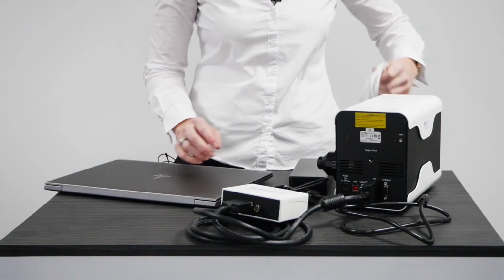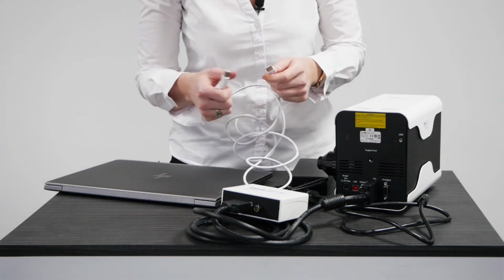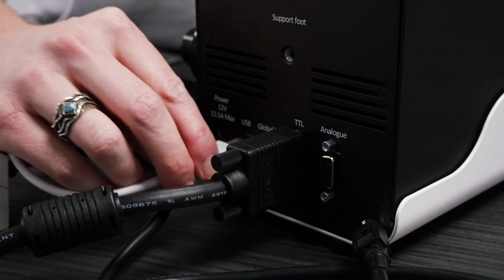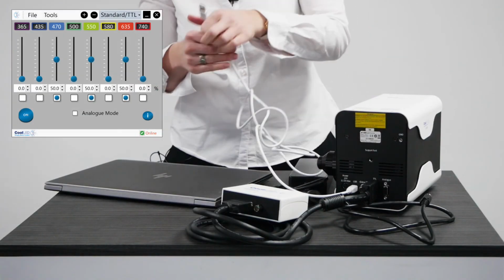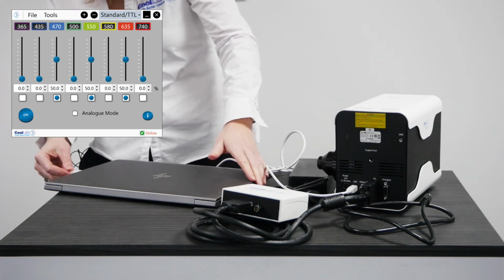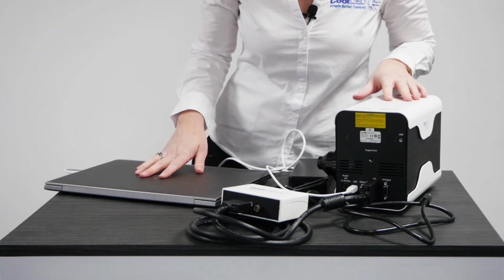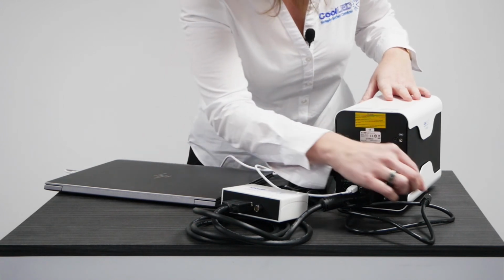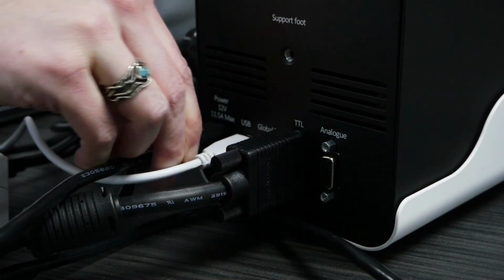Here you can also see that we will connect the pE-800 directly to the PC using a USB cable. And this is for the use of the LightBridge graphical user interface, which allows for control of LED irradiance settings. Once this is done, you are now ready to plug in the power supply to the pE-800. And once you have followed these instructions, you are now ready to configure your imaging software.